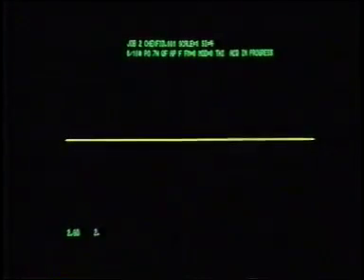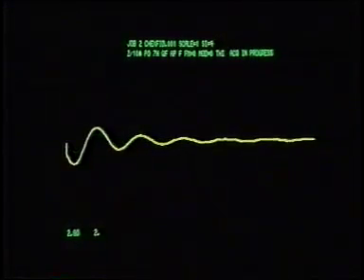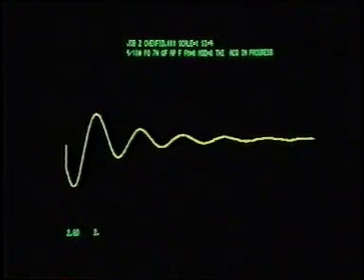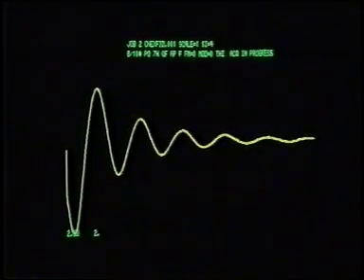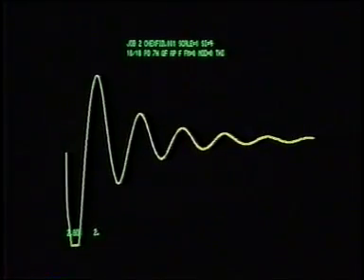However, NMR is inherently insensitive, so we tend to subject each sample to a number of pulses, each followed by a few seconds of data acquisition. The computer then adds together successive FIDs to build up a strong signal before carrying out the Fourier transformation.